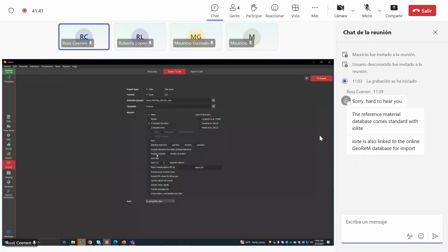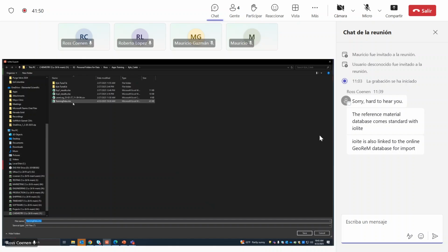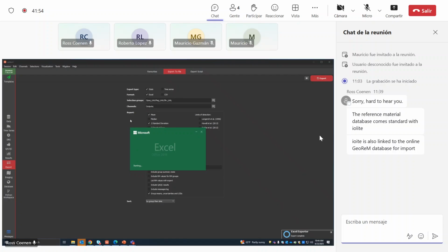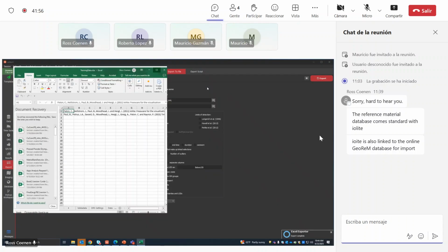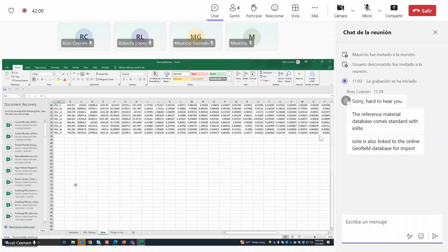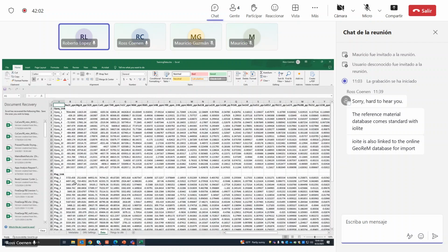And if we want, we can export group means. Perfect. Okay, interesting.